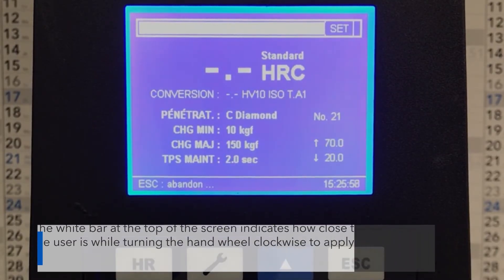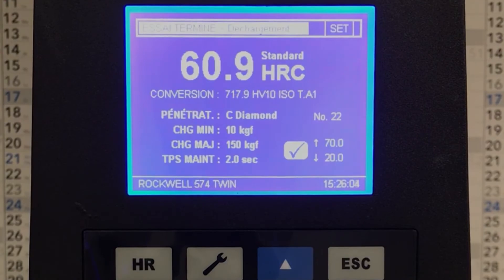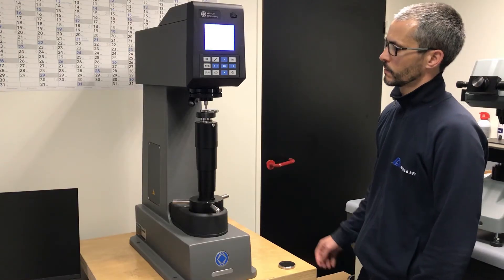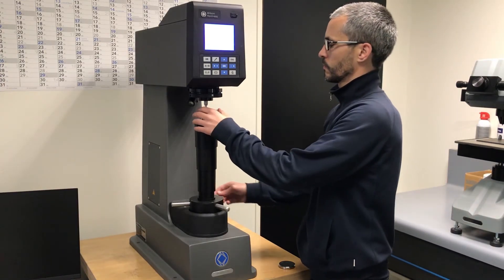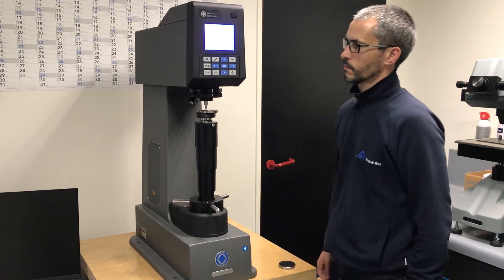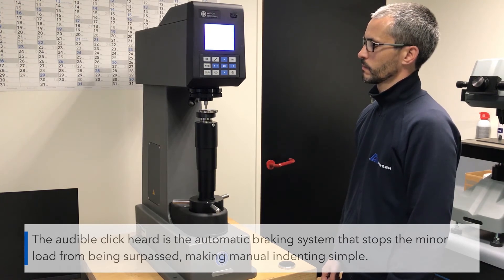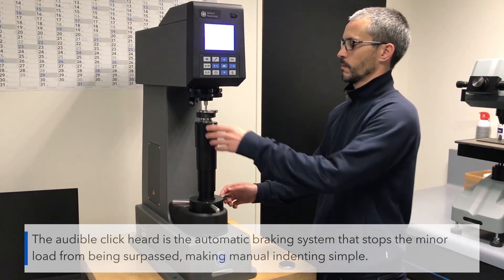The white bar at the top of the screen indicates how close to the minor load the user is while turning the hand wheel clockwise to apply the load. The audible click heard is an automatic braking system that stops the minor load from being surpassed, making manual indenting simple.